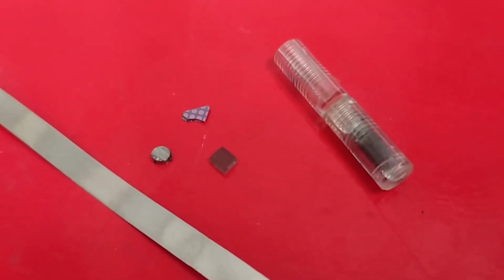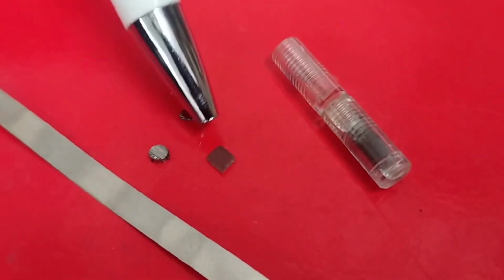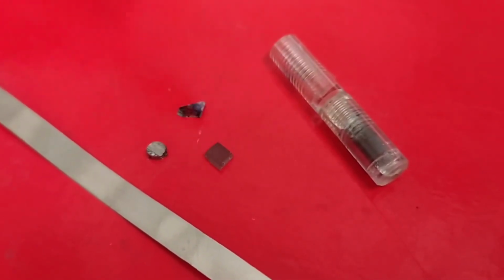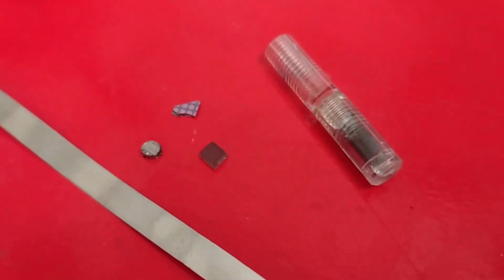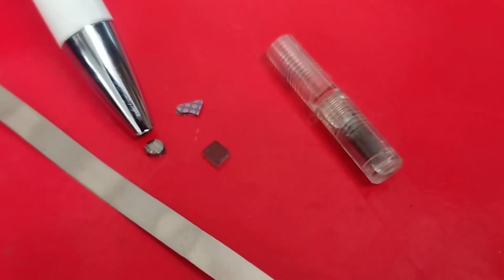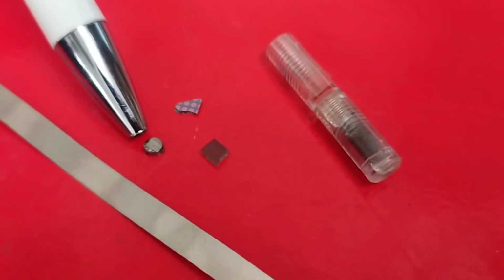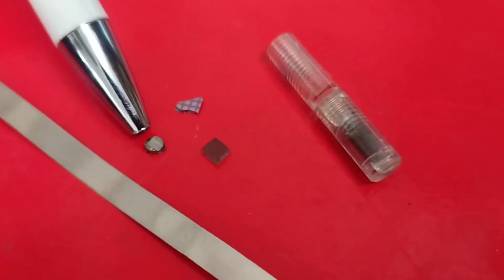The classical objects that one would like to measure are bulk samples like this one. Anyway, it is not a conventional bulk sample, as it is a nanocomposite. It is a polymer which embeds nanoparticles. Another example of bulk sample is this one, which is an Alnico hard magnetic alloy in the form of a disc, of a cylinder, that can be placed on some of the sample holders that we discussed before.